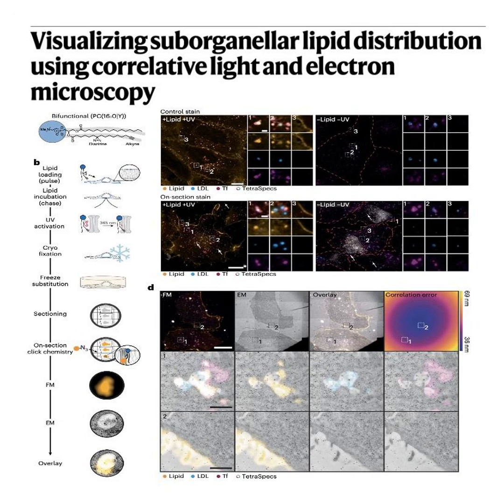The nanogold method works fine if you only need a sparse molecular label directly inside the EM image. But the fluorescence methodology, despite having all those extra steps, is infinitely superior for mapping the true dense distribution of these lipids. All right, let's quickly lock in those resin dynamics for the audience. Number 1, HM20 is an apolar hydrophobic resin. It blocks deep staining, limiting you to the surface, but it perfectly preserves physical architecture.